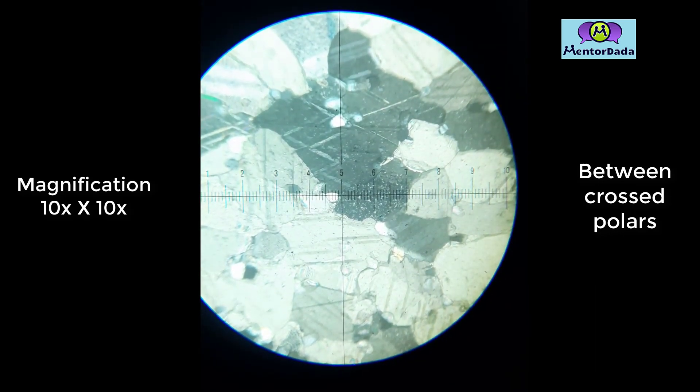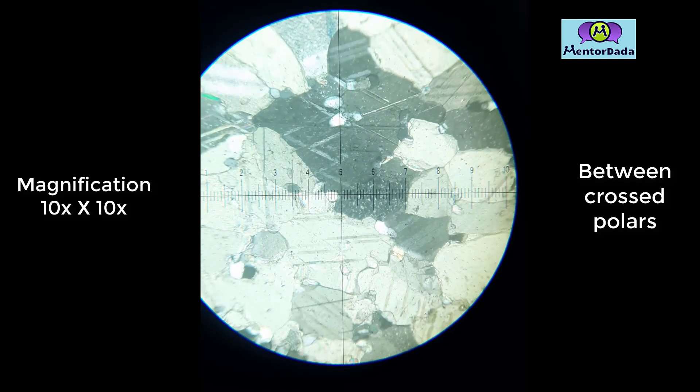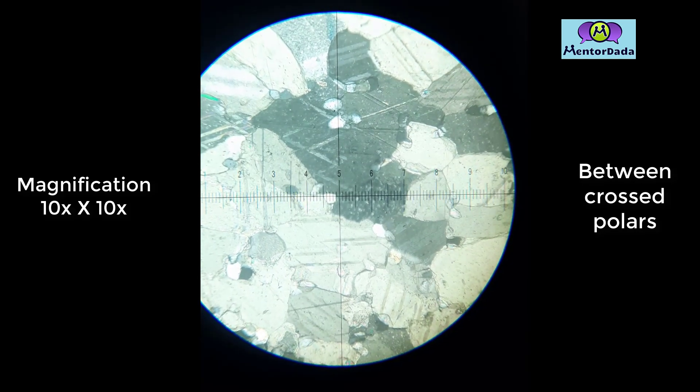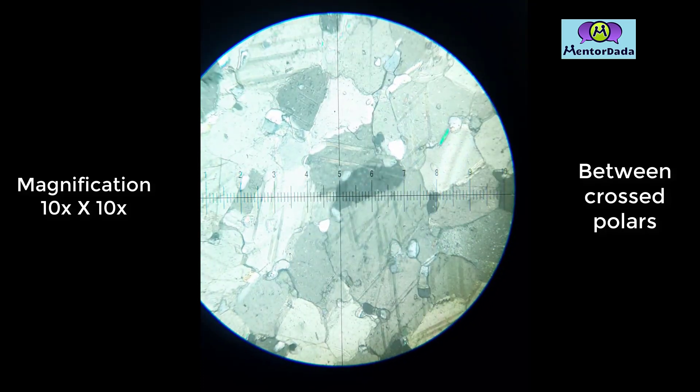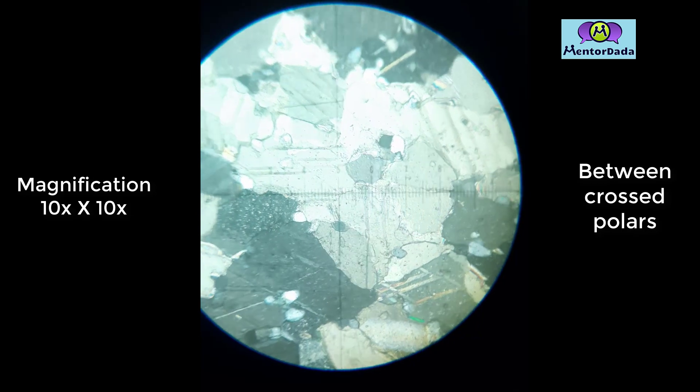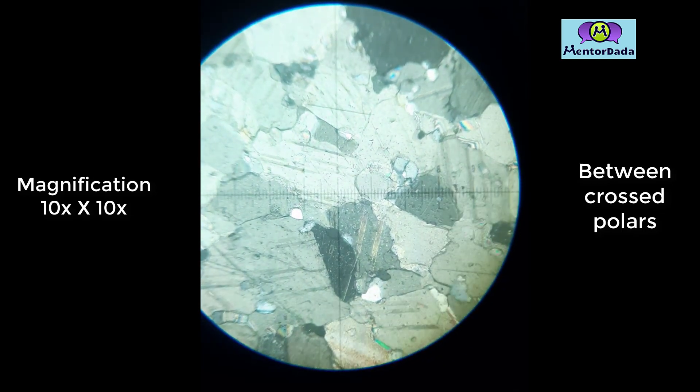As we rotate the stage, we can see the change of color. This is a property where we call this type of mineral an anisotropic mineral.